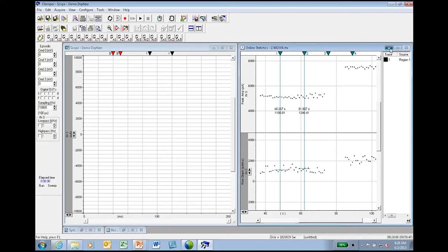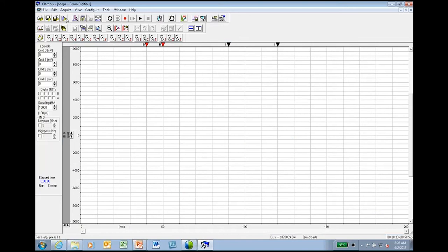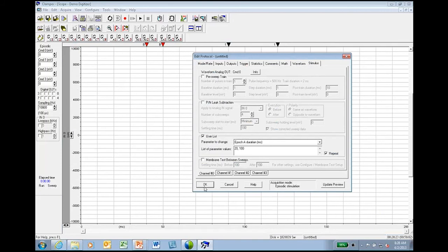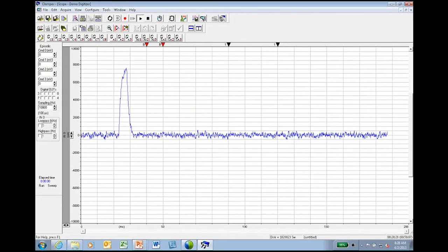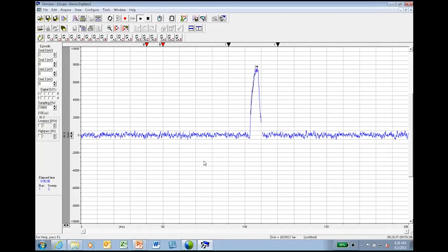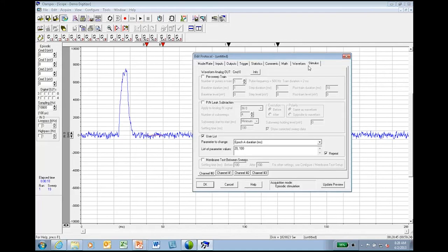Now I don't want this one right now. I want the full screen. If you go back to see the waveform, you can see here, before it was 100 milliseconds, but now it's listed. It's controlled by the setting here, 20 and 100 milliseconds. What I mean is that if you click here, the first comes here, the second goes to here. So basically, you can see I can customize the changing of the duration.